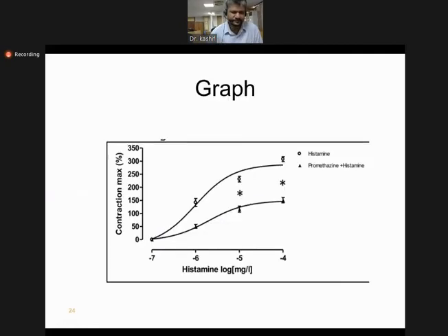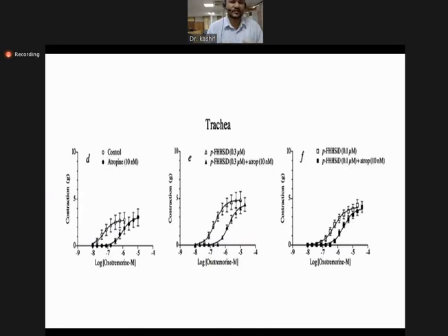We use these practicals in the laboratory just to give you an idea of the theory that you study about human tissue. Once we do the experiment on an animal model, they are basically also repeated on human tissue as well. But for laboratory purposes, we use the animal model. The rabbit is closer to human tissue, so we use this rabbit model for that.